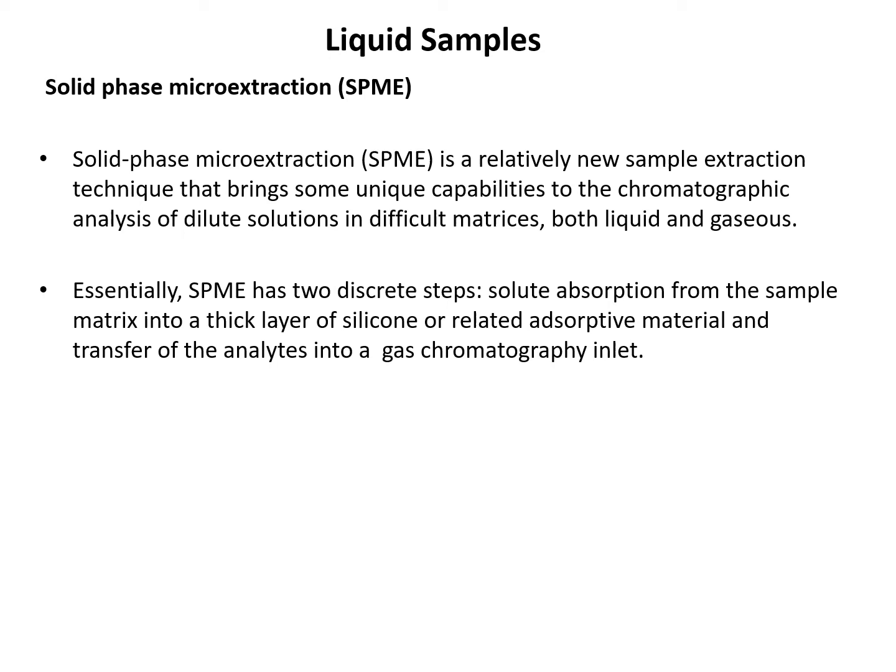It brings some unique capabilities to the chromatography analysis of dilute solutions in difficult matrices, for example in both liquids and gases. SPME basically has two discrete steps: solute absorption from the sample matrix into a thick layer of silicone or related absorptive material, and transfer of the analyte into the gas chromatography inlet.